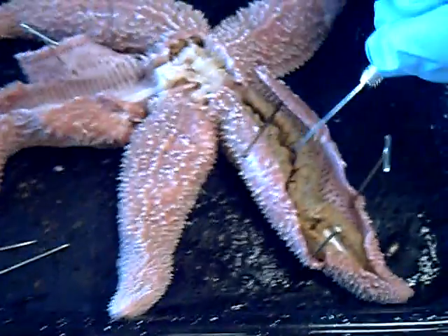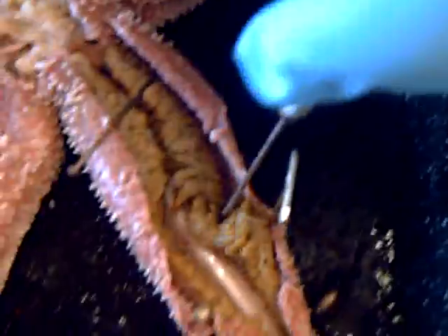We're looking at a gutted starfish right now. This is called the pyloric cecum. This is a digestive enzyme production station. They're throughout each of the arms.